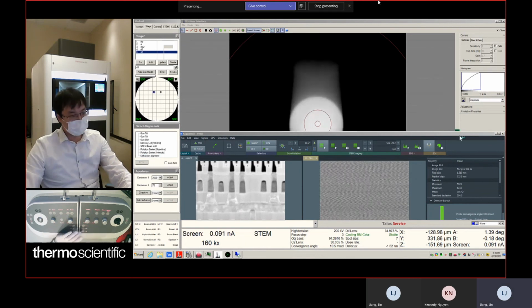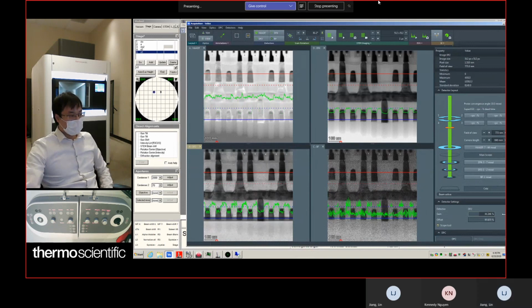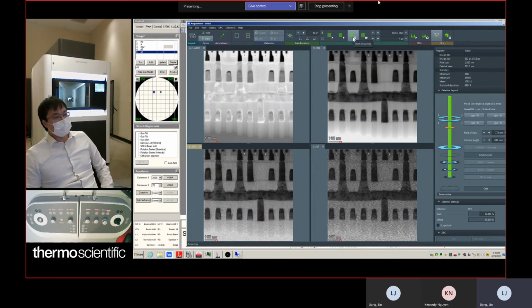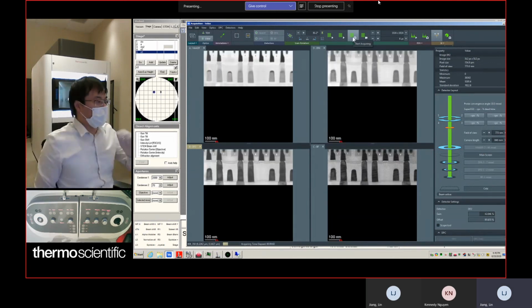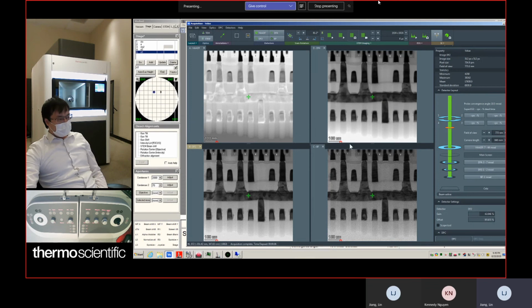Okay. So again, you get a positive signal in your bright field. Let's take the image. This is the 840 millimeter camera length. So in this case, the image looks like a bright field image contrast, and the signal-to-noise of your bright field image becomes poor, because your camera length becomes longer, it's hard for the electrons to reach your bright field detector.